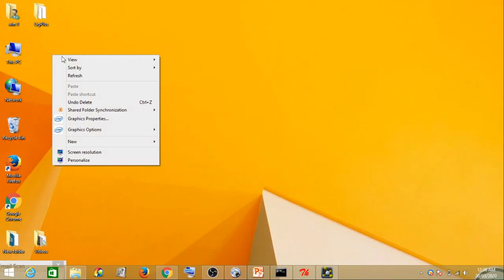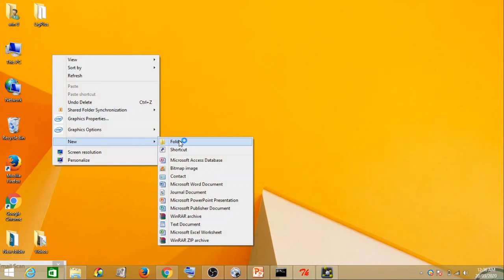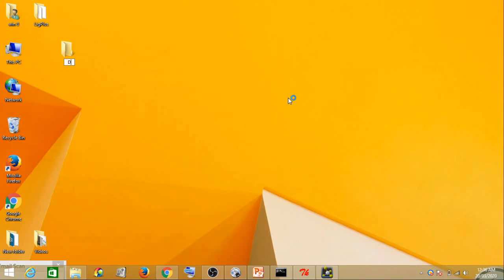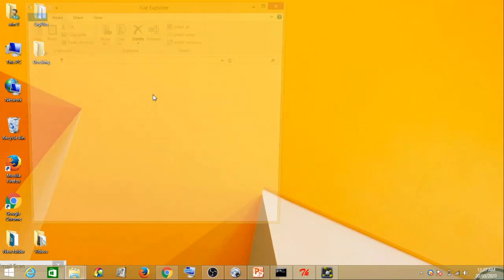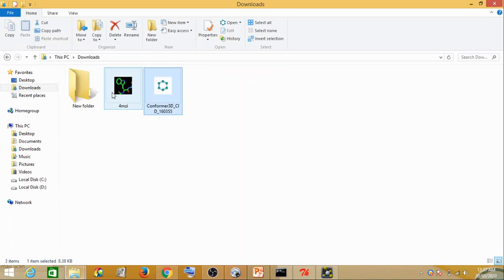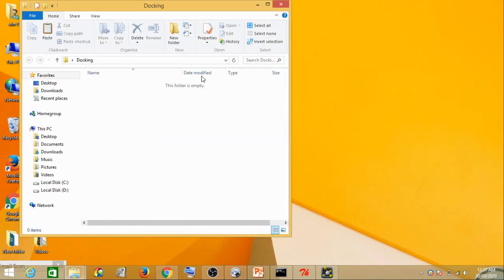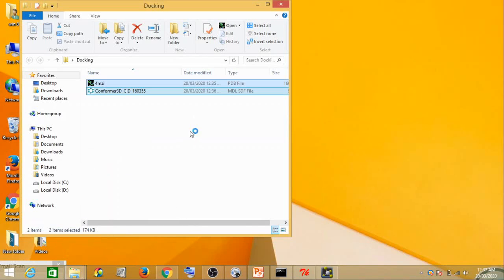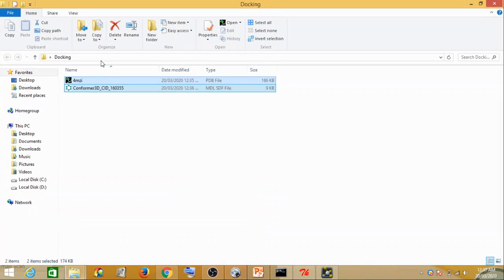Before we move ahead, let us create a folder named 'docking.' We have created a folder named docking. Open this folder and take both these files, cut them, and paste them here. I will rename the protein file from 4MZI to 'protein' for simplicity, and rename the conformation file as 'ligand1.'